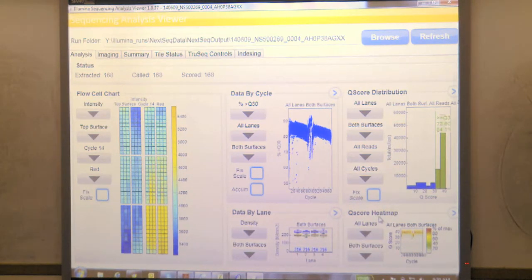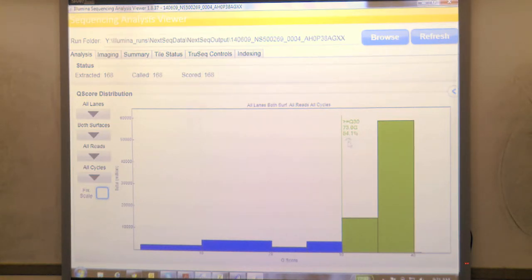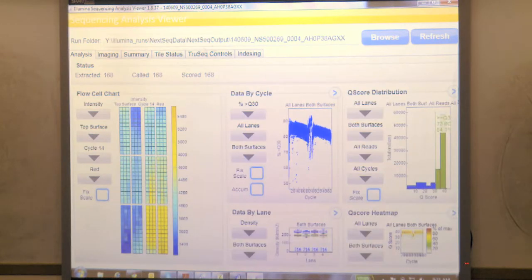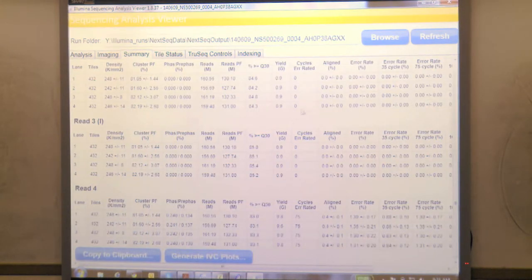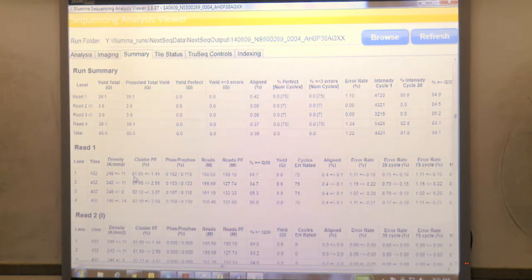There is a quality score distribution and quality score heat map that tells me if a run is good or not. We usually look at the total Q30 bases for the whole run - we want to see it over 80%, and this is 84%. The next tab is the summary tab, where I have more statistics including cluster density per tile for each individual lane, and pass filtering. In this case, 81% of the clusters found passed filtering.